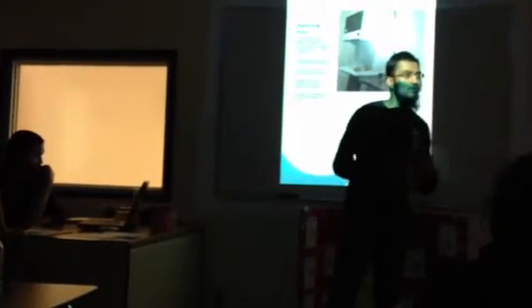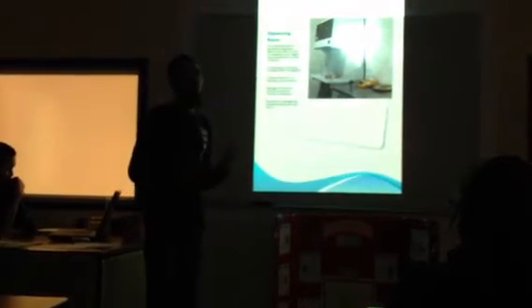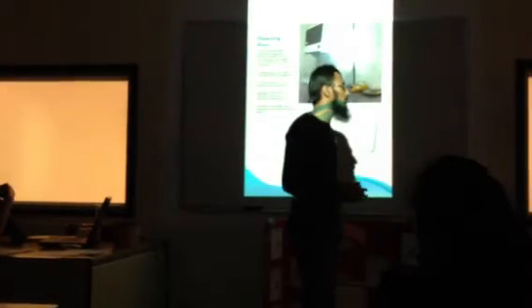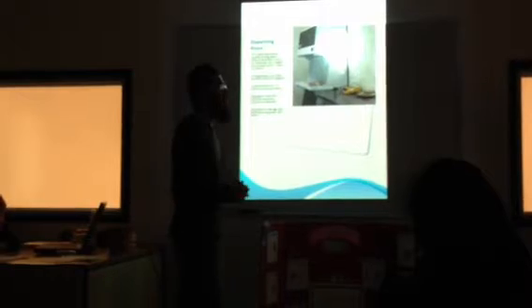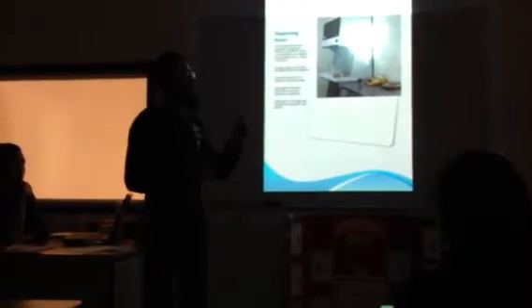Now in the quarantine area, what goes on is that before the pharmaceutical technologists get involved with their job, like making the product or tablets, anything, they require all the ingredients. Before we cook, we need the recipe. So we have the recipe, but how much we need and everything we need will be measured here. Exactly what's going to be needed for your medicine. Say you're making a Tylenol, and in Tylenol there are API and different ingredients that you're going to need. That amount of API or active material which is going to be used in Tylenol will be weighed here by the QC department or by the selected person, and that will be given to the technologists.